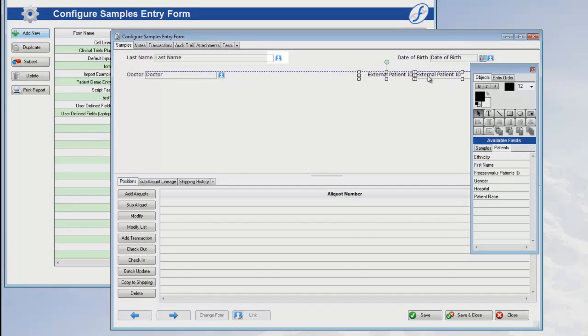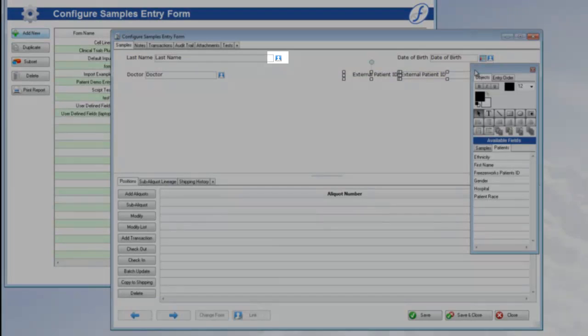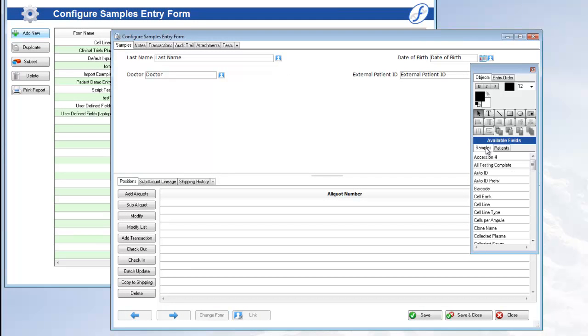A patient field is designated on the form by the patient icon to the right of it. I'm going to add some samples fields as well, so my form is not too bare.